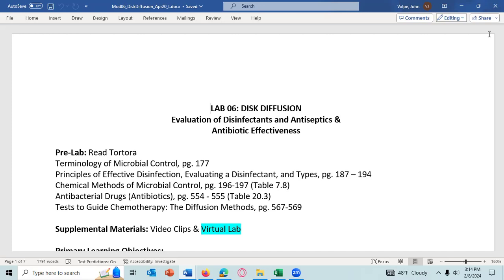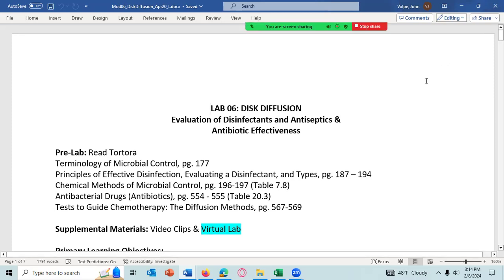And usually this is not done unless the patient is carrying a bacteria strain which is resistant to some or all forms of antibiotics. But like I said, sometimes it's done when they're trying to determine if there's any antibiotic which will be effective against the bacteria. And it's a very good test. However, this test can be used in other ways, like it can be used to test the effectiveness of a disinfectant or the effectiveness of an antiseptic, and it can be used to test other ingredients.